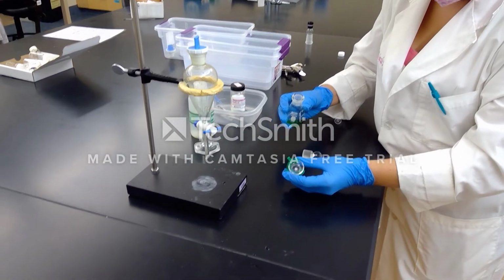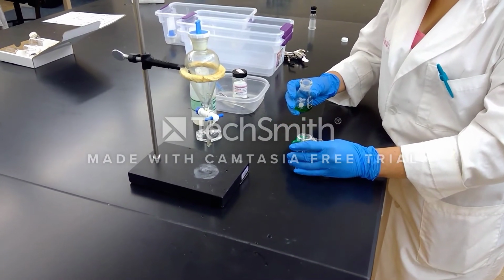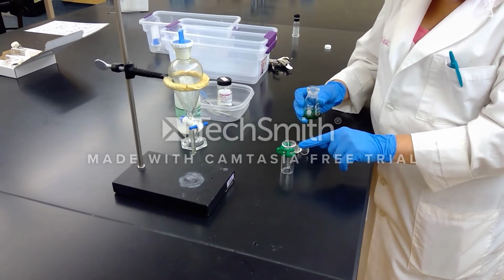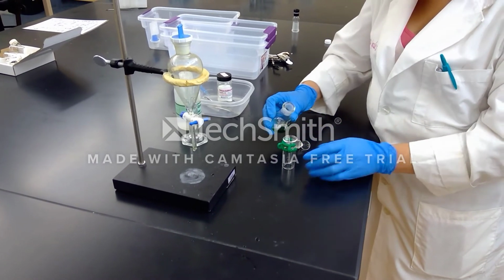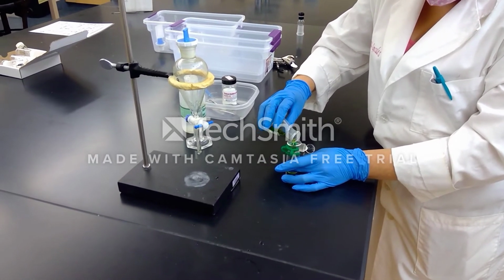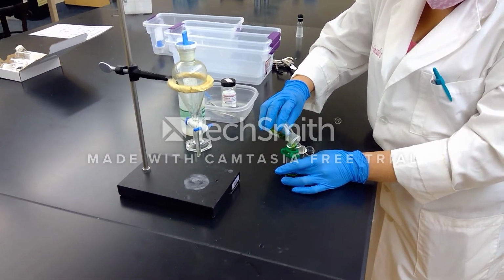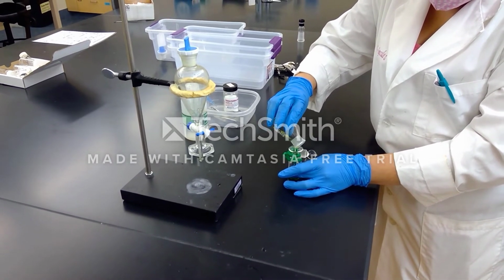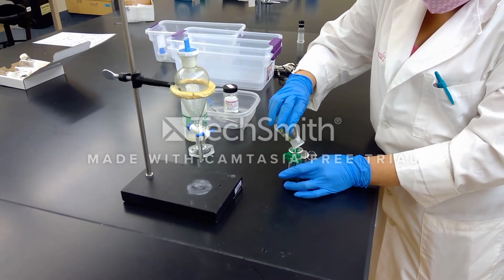I don't know if you can see the white dot of cotton. And what I have here around it is just a clip so that we create a little gap of air between the two pieces of glass, so we don't create a vacuum in there. All right, so we're going to go ahead and filter this through. And the reason why we're filtering this is to prevent any of the sodium sulfate, which is the drying agent here, from coming on through to the other side.